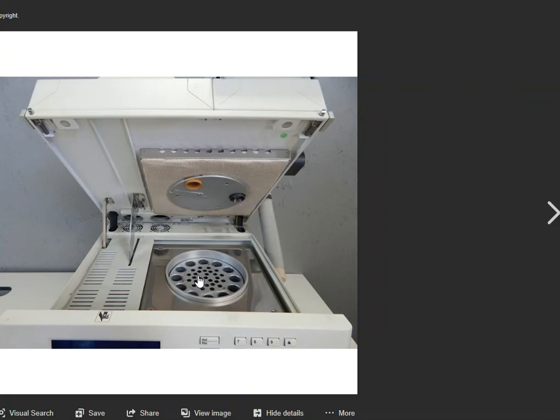So for instance, let's say that we tell this machine, I want you to heat the sample for 10 minutes. And on the GC box, the runtime is 5 minutes. Then it's over. Okay, well, if this went normal, what would happen is that it would lower the sample in, heat it for 10 minutes, take the sample, transfer it over to the GC, and in 5 minutes' time, the GC would now be finished. Well, you don't want a delay, meaning that you don't want the GC to be finished, and then this one takes its second sample and just begins the heating time.